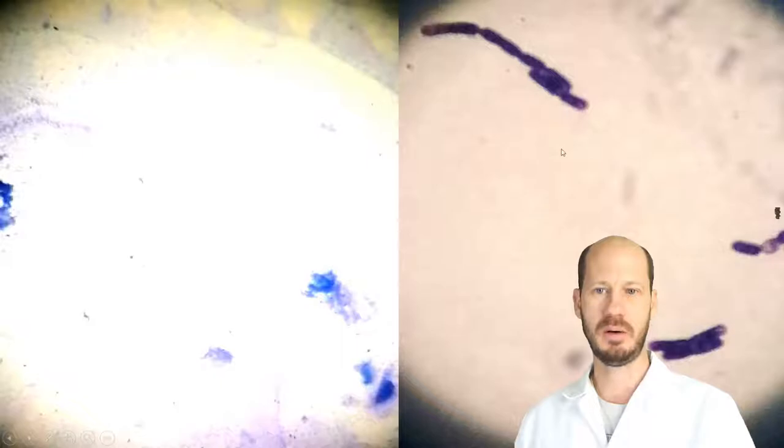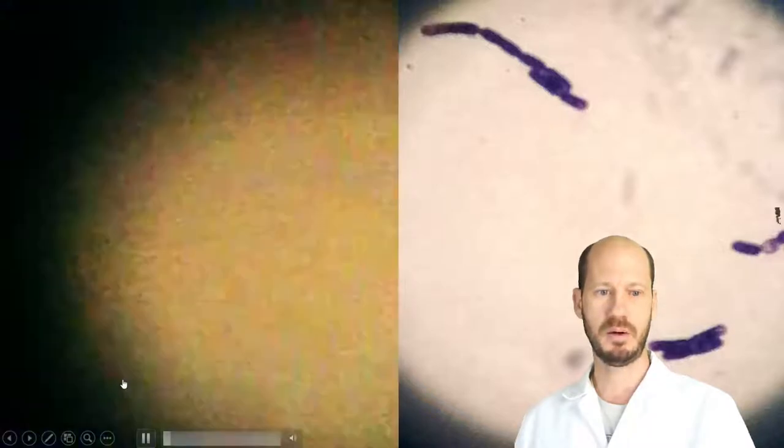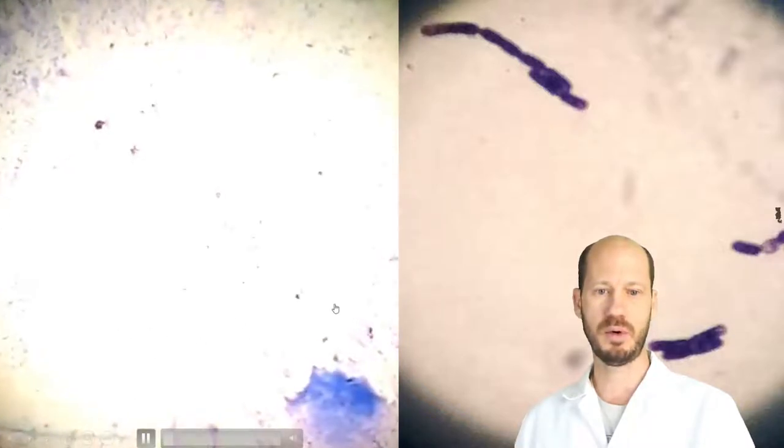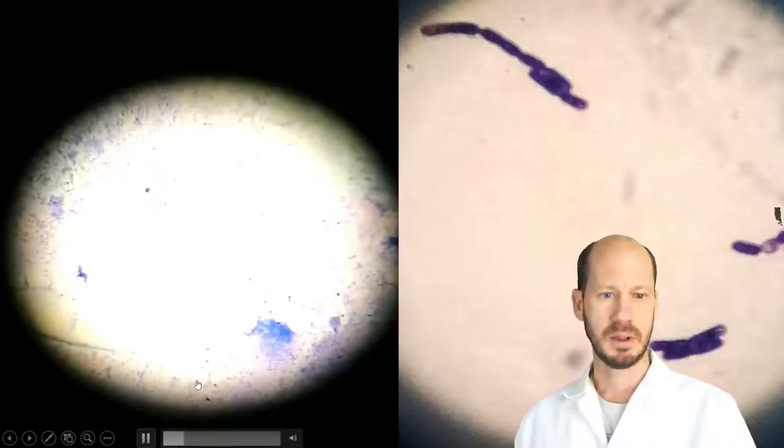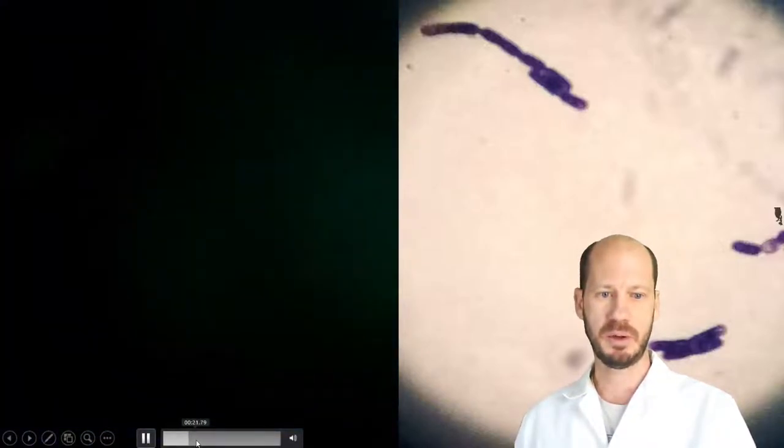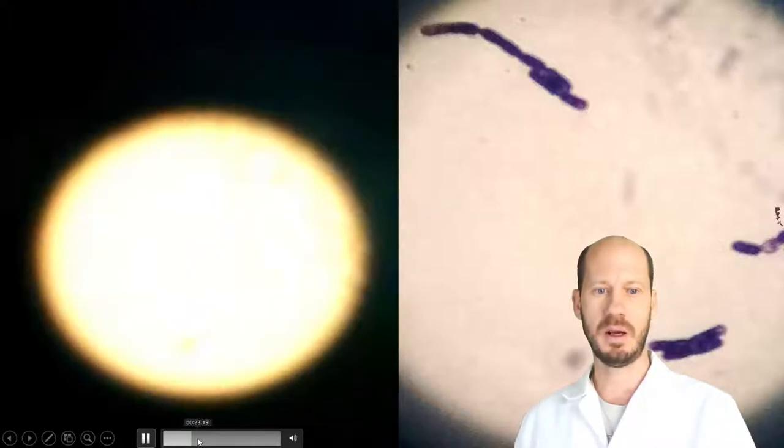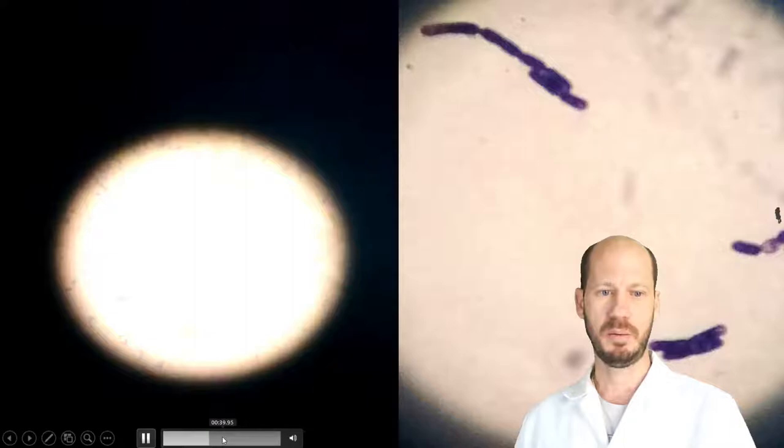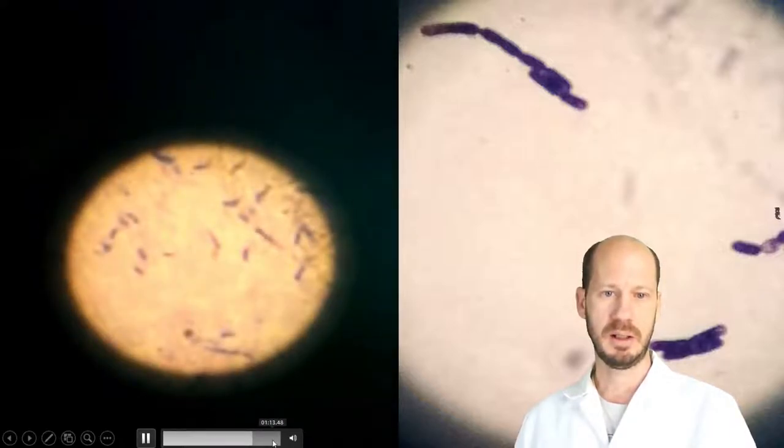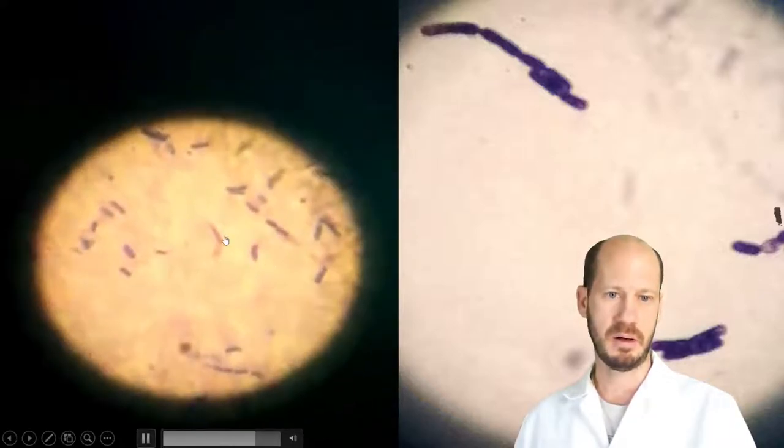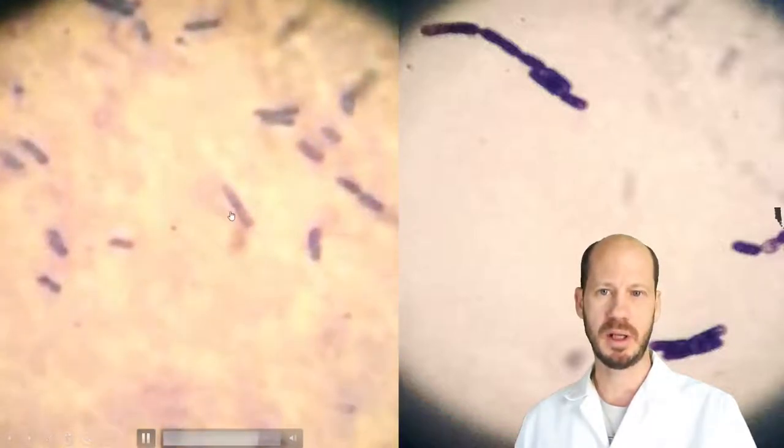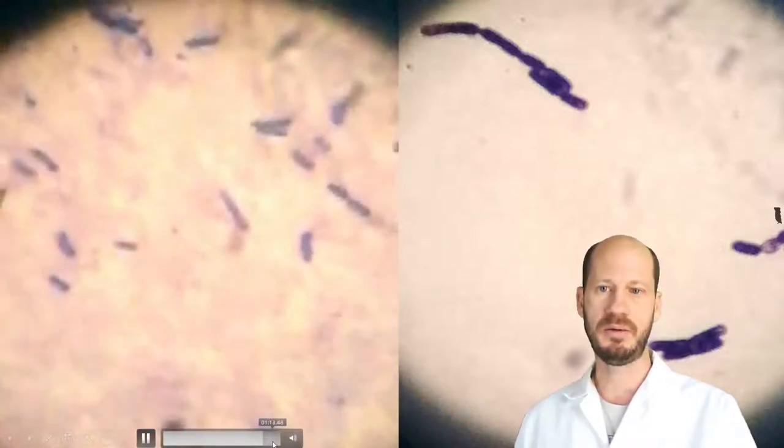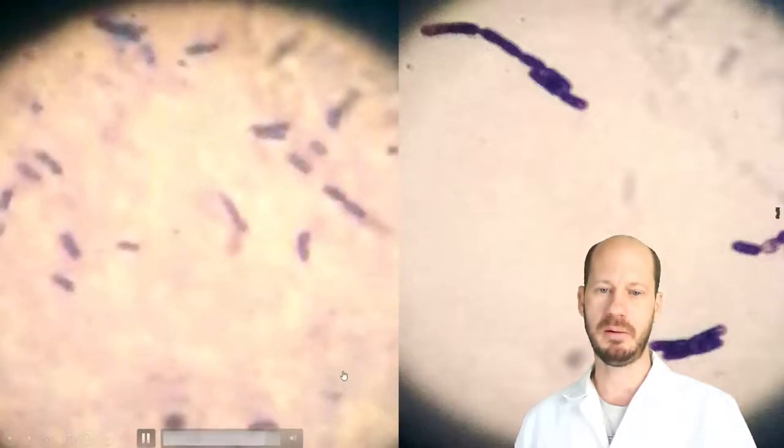This is what we are seeing now is the focusing process of watching those cells. It turns out it's a gram positive because it's very violet. But if you just move up and down between different magnifications on the microscope, as you see here, that you will be able to focus on these cells and determine that they are what type of cells are they, the shapes, and also the color will tell you if they are gram positive or gram negative.